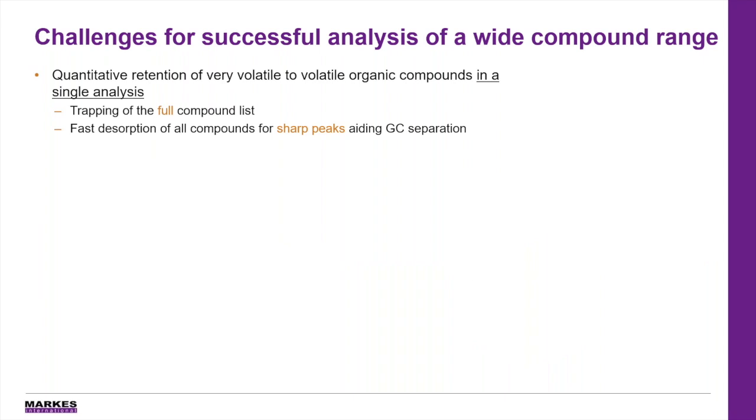Now, it's a really wide compound range that we're looking at here. So there are a number of challenges we need to address to be able to get this successful analysis. And the first one is the fact that we need to be able to trap the full compound list and get good desorption of all these compounds as well, as those sharp peaks will aid our GC separation.